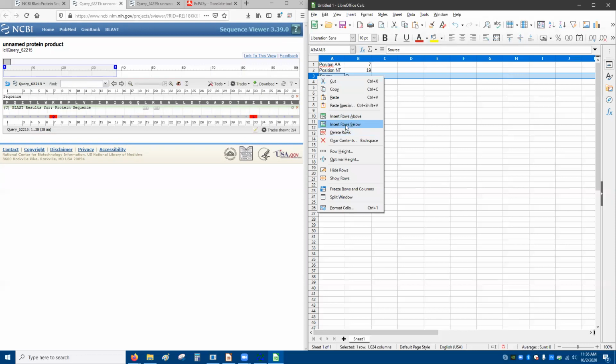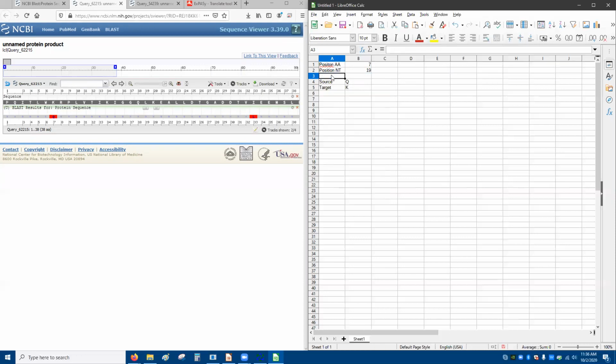Insert one more position. So on the 3 end, this is on the 5 end. This is going to equal this plus 2. Okay, now I can use that for all of them.